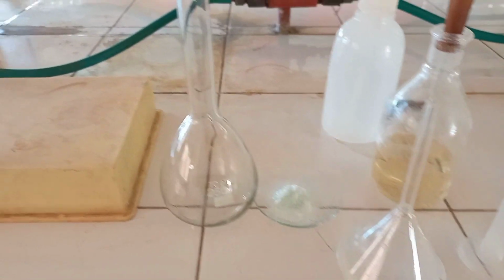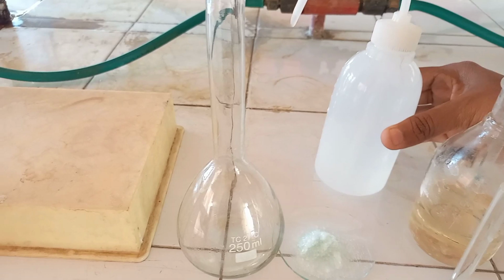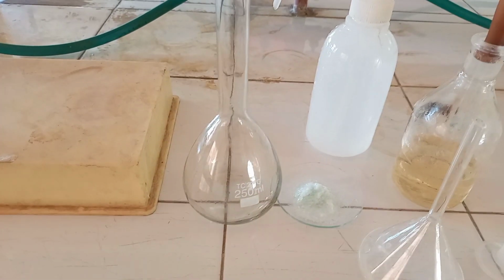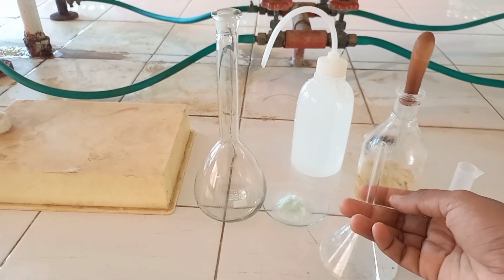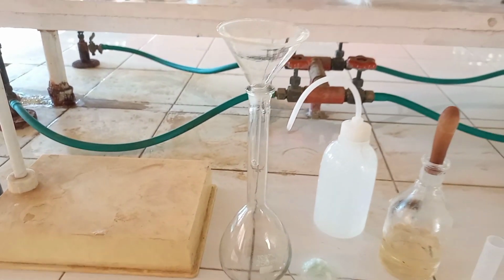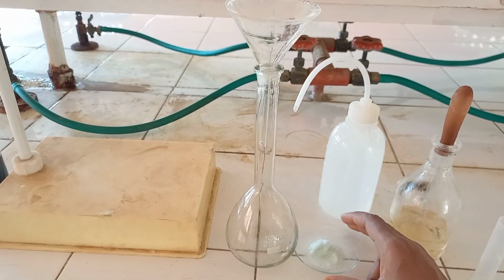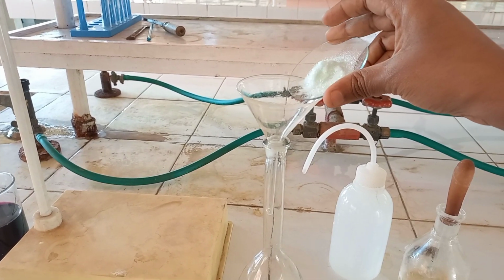And this funnel we will require for the preparation of the standard solution, along with concentrated H2SO4 and a wash bottle. In this white wash bottle I took water. Now what I have to do, first of all I will take a funnel and keep it on the standard flask. After keeping the funnel on the standard flask, I will pour this salt into it.